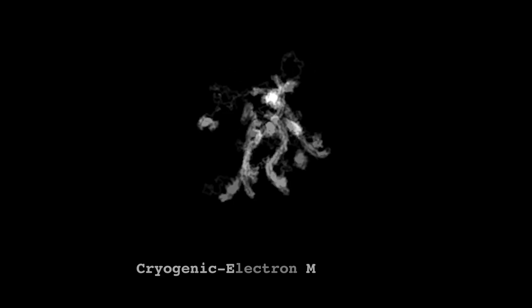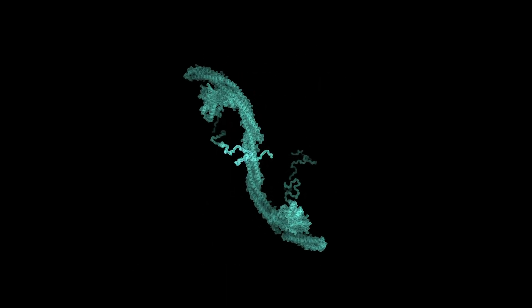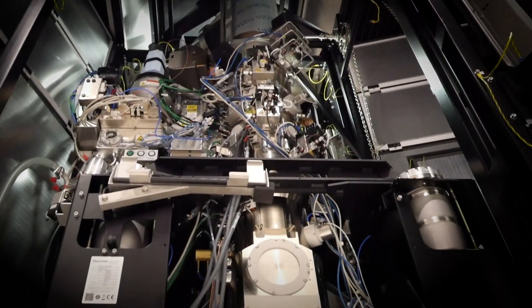Cryo-EM, or cryogenic electron microscopy, is a microscopy technique that lets you see molecules at near atomic resolution. Despite the fact that it's grown extremely popular over the last few years, it's really only being used to study rigid static molecules.